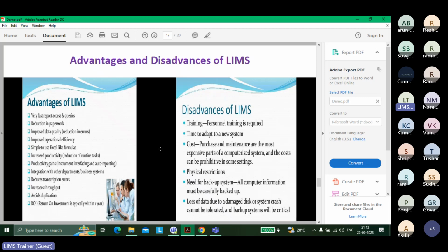And the instrument is already integrated. If you are able to automate certain instruments by writing some scripts for parsing and connecting it with LIMS, it directly takes the values and your value gets populated. Life is getting simpler.